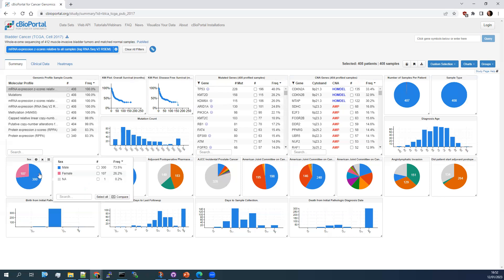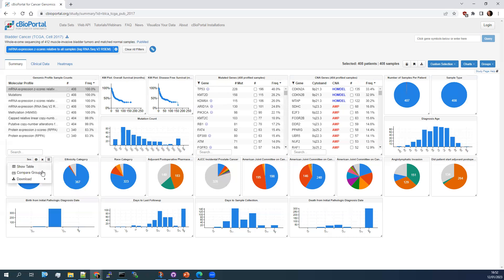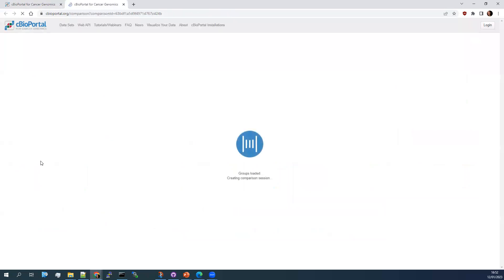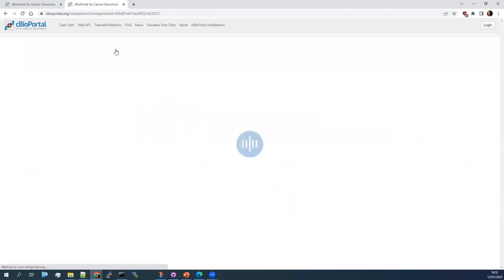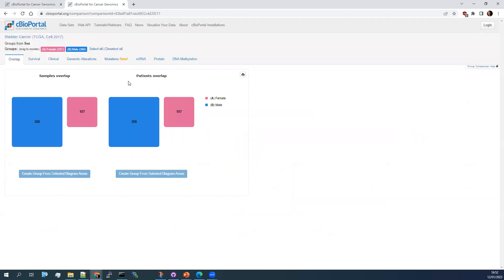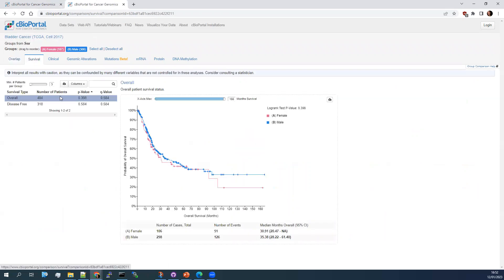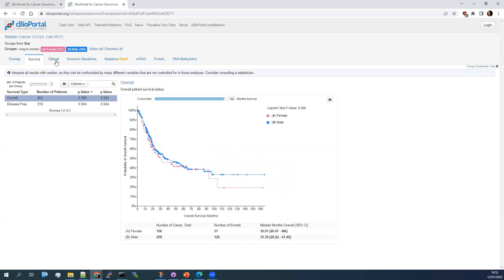So down here, sex of the patients in the cohort. Again, you can start looking at the differences by comparing the groups. So if there's missing data, you sometimes have these NA samples. So you can get rid of those because some of the comparisons don't work well with three groups. Two groups is better. So comparing male and female samples here, you can look at survival and see that there's no real difference in survival between these groups.